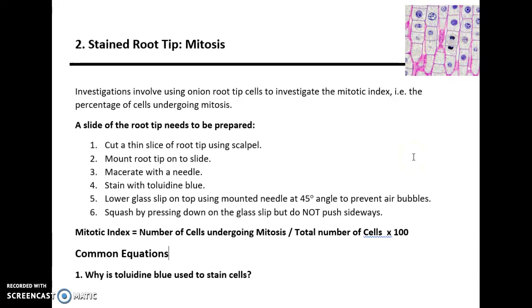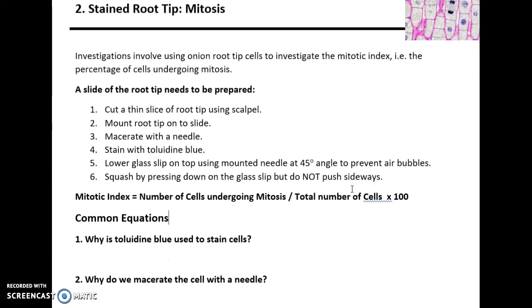The centrioles move to the poles — that would be your evidence for stating a cell is in prophase. For metaphase, chromosomes have aligned on the equator (the metaphase plate) and spindle fibers have attached to the centromere. In anaphase, spindle fibers have contracted and sister chromatids have been pulled to the poles. In telophase, a new nuclear envelope develops and the cells split to form two, going into cytokinesis.